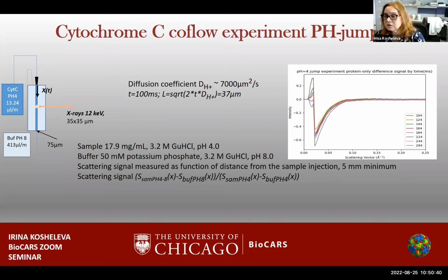I think that they also observed time delays with these mixers on the order of magnitude of milliseconds in the laminar cell, tens of milliseconds, if I remember that correctly. So the answer is yes, we can mix with the cell. However, it will be a pretty large time resolution, maybe 50 milliseconds and more.